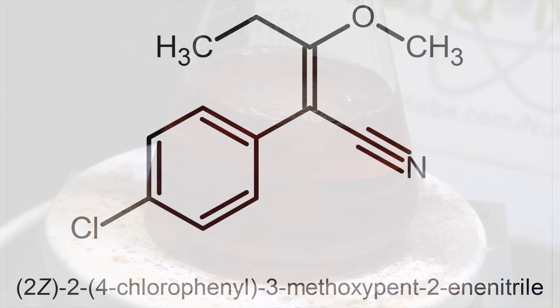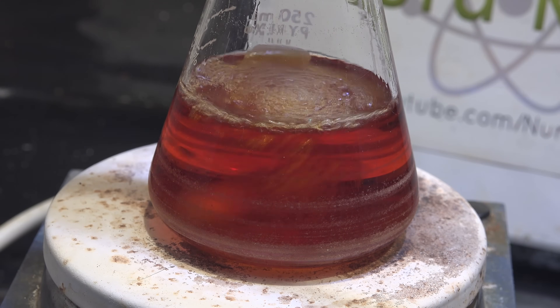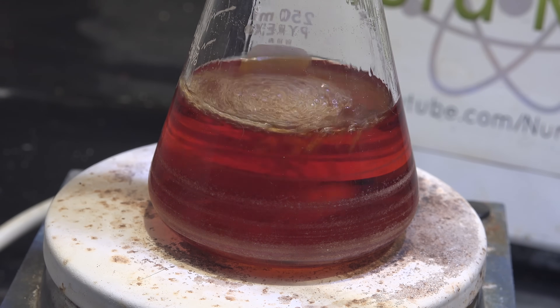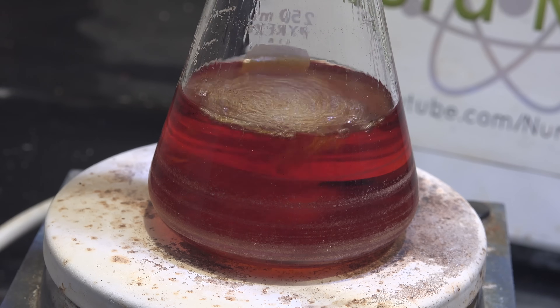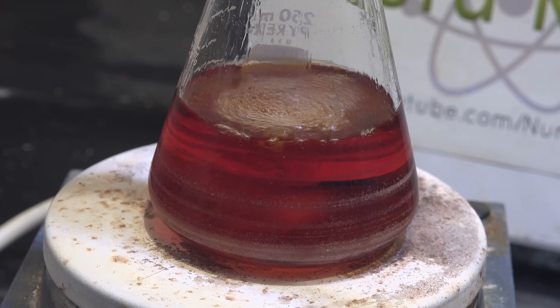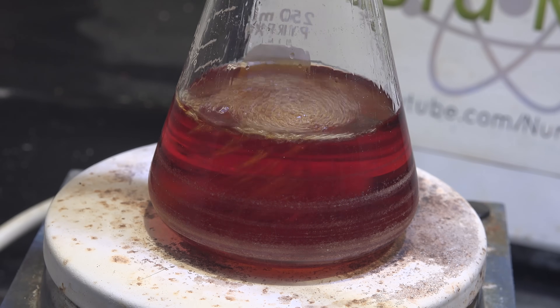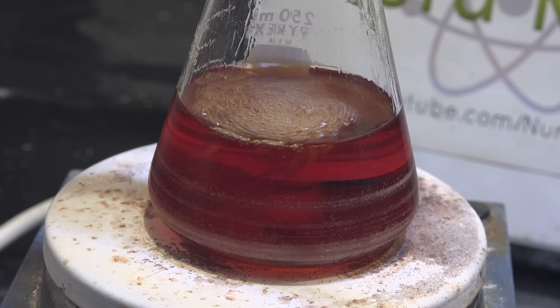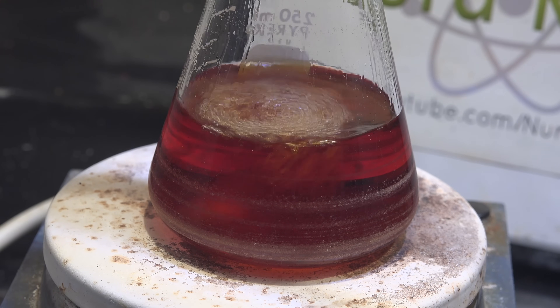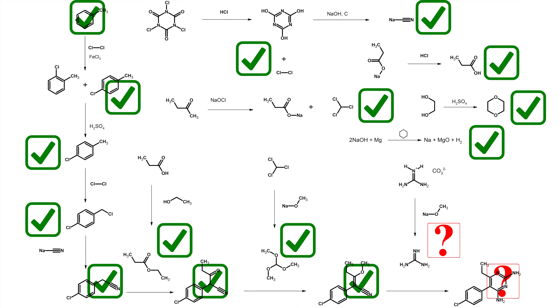The full name of the target compound is 2-parachlorophenyl-3-methoxypentene nitrile, but I'll just call it the enol ether to save time. Interestingly, if you watch closely you'll see the liquid level decreasing despite efficient refluxing — we're losing methyl formate as it boils out. Methyl formate has a boiling point of just 32°C, too low for the reflux condenser to efficiently condense, so it boils out into the fume hood. Keep refluxing for 3–4 hours, then turn off the heating and let it cool. We have now cleared step 6 of the main pathway.